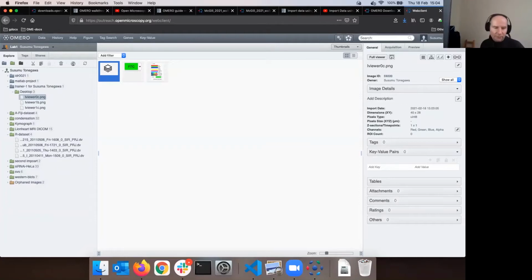So how are you doing with your imports? Can we now, let's say, very good, very good.